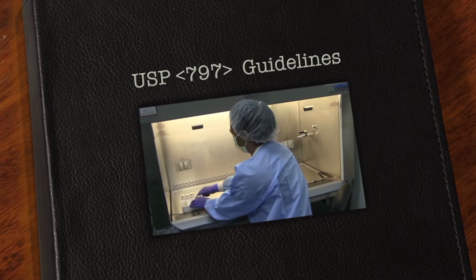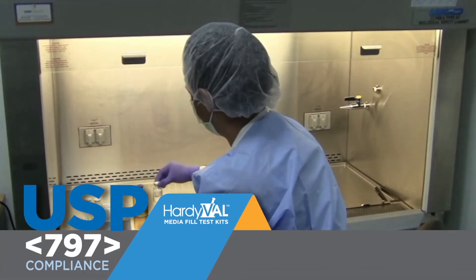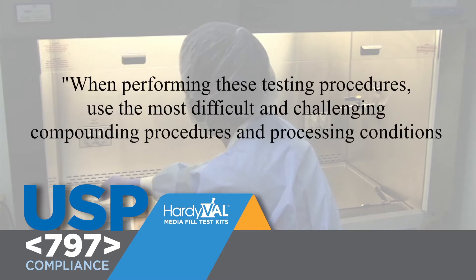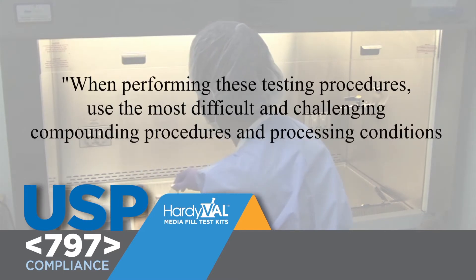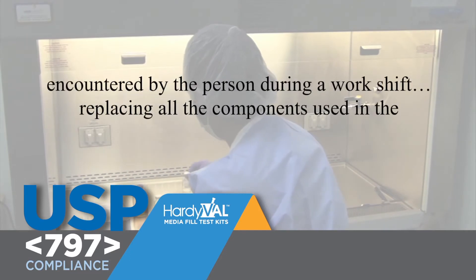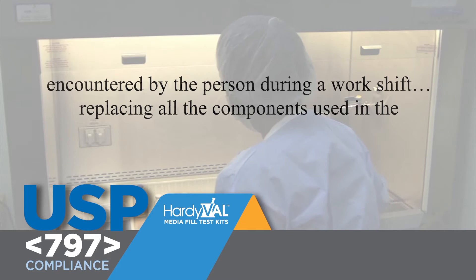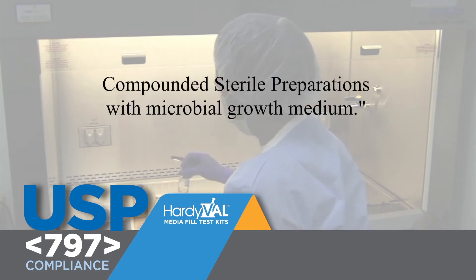How do I determine which kits or products are right for me? USP 797 states in part: when performing these testing procedures, use the most difficult and challenging compounding procedures and processing conditions encountered by one person during a work shift, replacing all components used in the compounded sterile preparations with microbial growth medium.